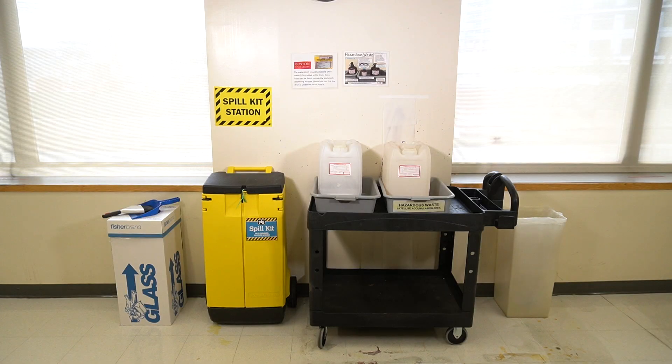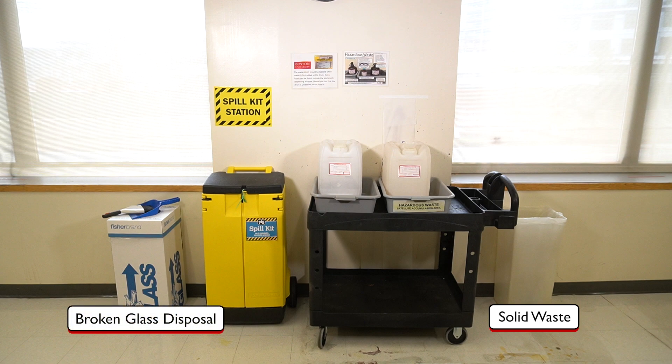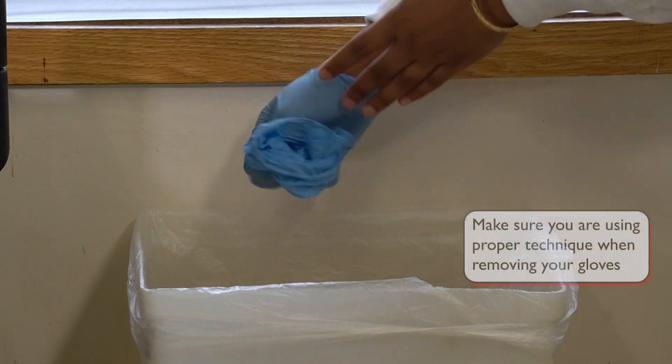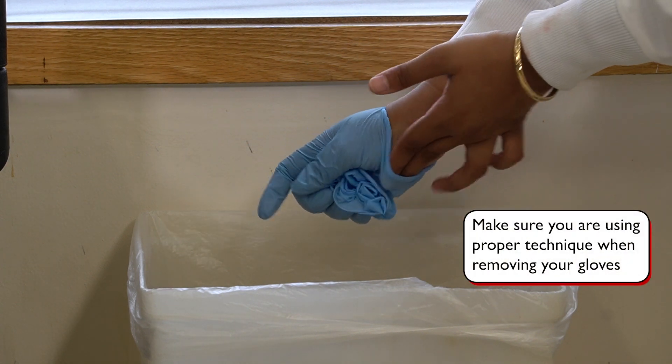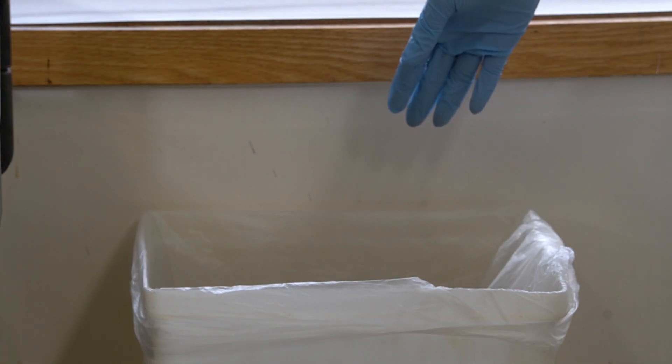There are three types of waste containers in our teaching labs: solid waste bins, broken glass disposal boxes, and liquid waste bins. Solid waste, such as used gloves and plastic pipettes, must be disposed of in the solid waste bin.